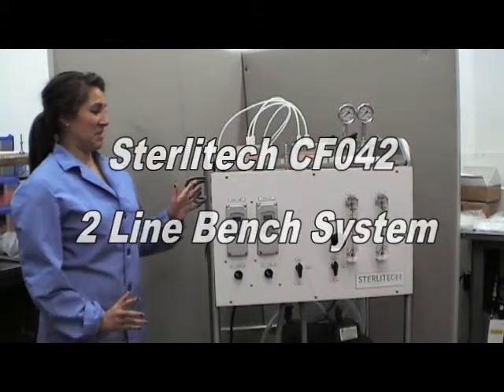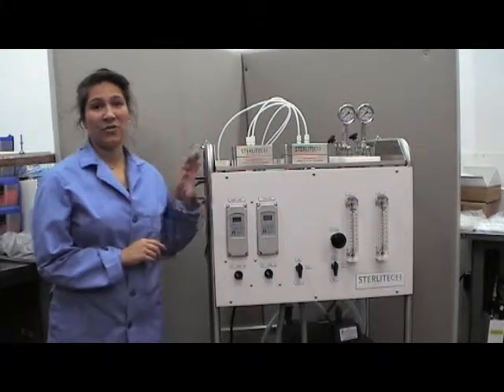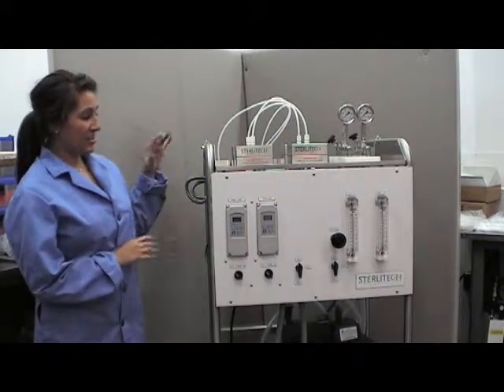Your bench system is clearly labeled for your convenience. So we'll start by walking through the different components so you can see where they're at.